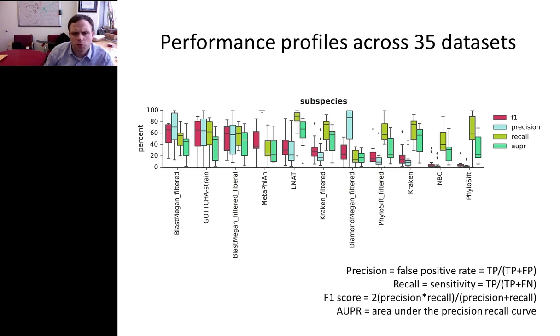But if you think, say, it's species, or you go down to even subspecies level, the strain level identification is still one of the really hardest challenges from shotgun sequence data, but is also where the most important factors are to be measured. So this is, while the most difficult, perhaps still one of the most important.